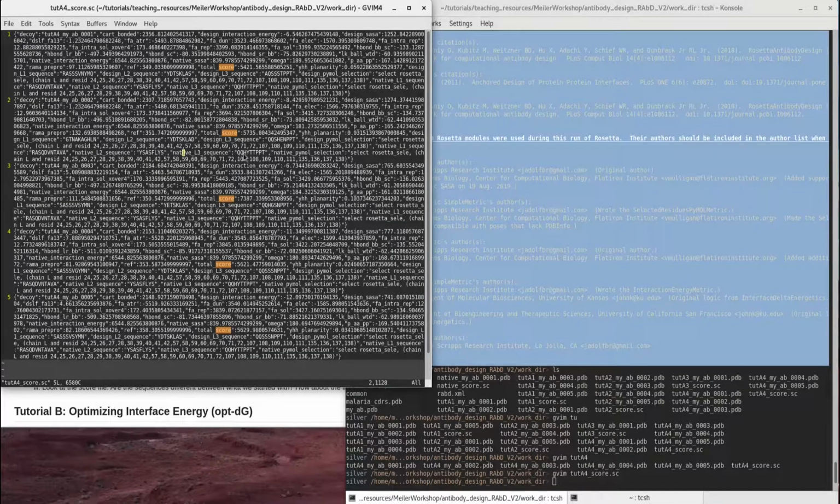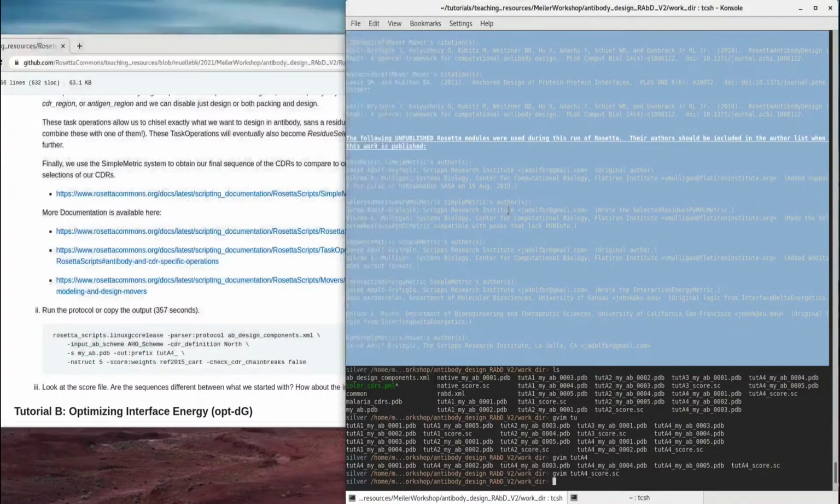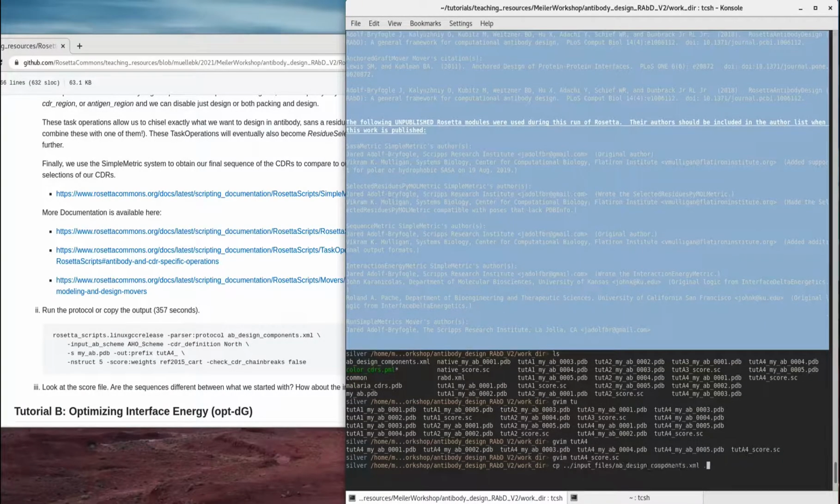So it's a way to compare the two. So you can obviously fish this out individually. But if you're just looking at everything at once, this is the way to do it. So yeah, just use the score file command as previous and look at this one instead to look at the differences between everything.